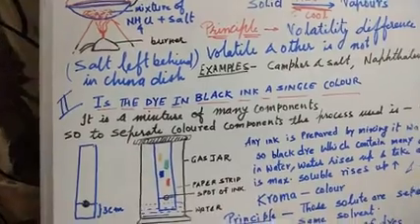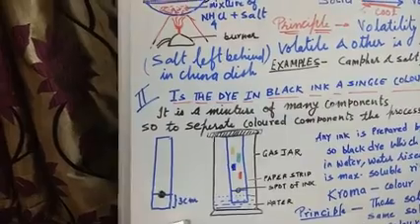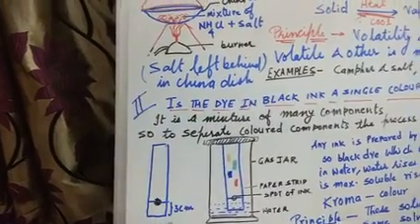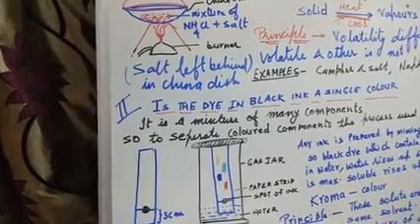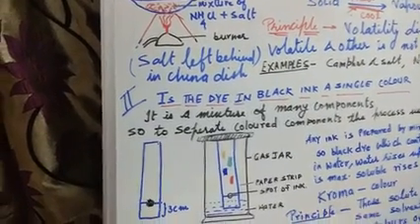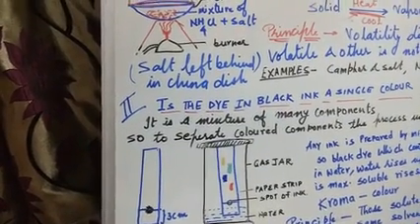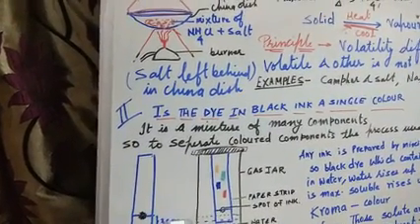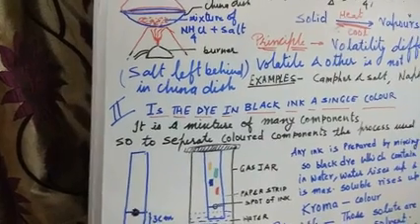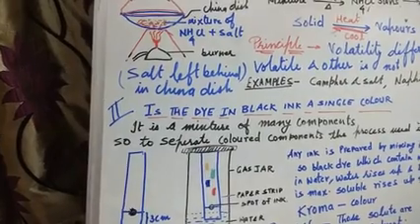Okay students, so here is how it is performed. A filter paper strip is taken. Usually chromatography is performed on a filter paper having reduced pore size. Normal filter paper has a bigger pore size. पोर्स का जो साइज होता है वो बड़ा होता है नॉर्मल फिल्टर पेपर में, पर हम जिसमें क्रोमेटोग्राफी कराते हैं, पोर साइज इज हाईली रिड्यूस्ड, बहुत छोटा होता है पोर का साइज.